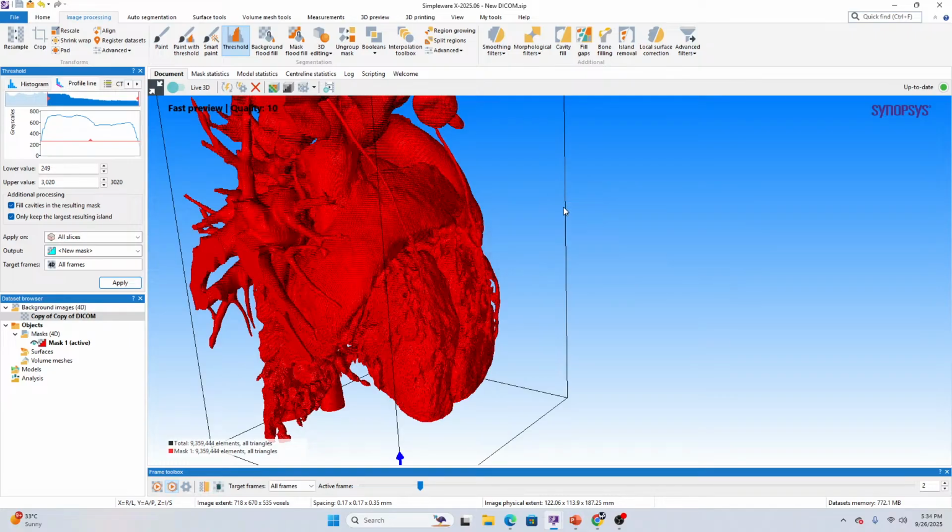There's also a dedicated GPU requirement to use this background volume rendering or to use auto segmentation. The minimum recommended system setting is around 8 GB of GPU. Any RTX 3060 or above is basically recommended to run the software efficiently. So it will take some more time to process.